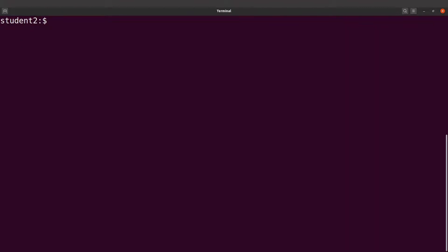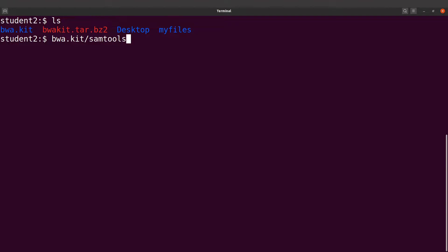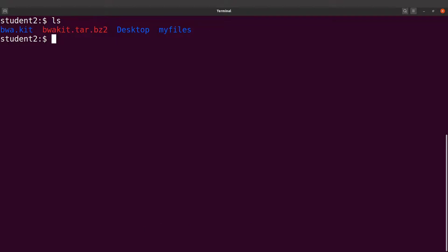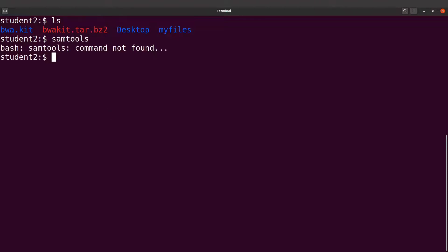From here you can call samtools by specifying the full path: bwa.kit/samtools — and this should run samtools for you. With the current approach we have to specify the full path to the samtools binary, which can be problematic if you are in a different directory. If you just type samtools it will say command not found. What we want is to just type samtools and have the command execute successfully, so we are going to set a PATH to this directory.